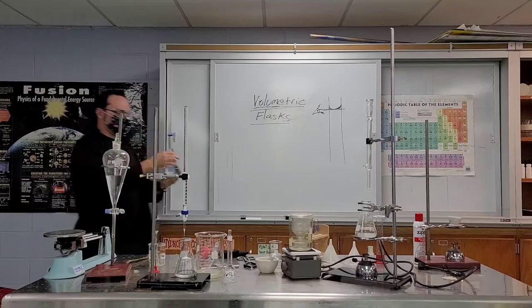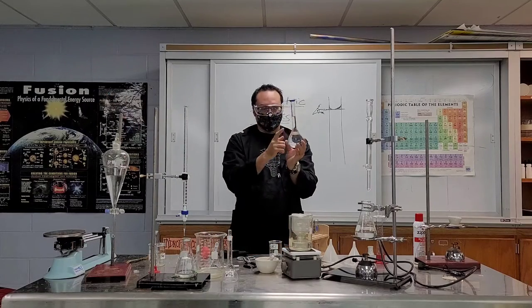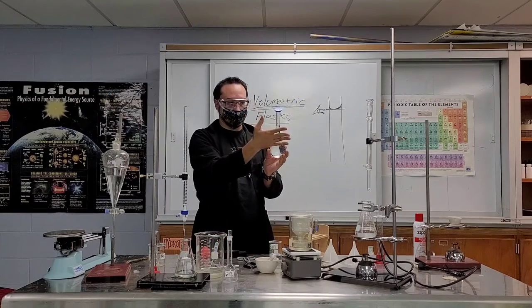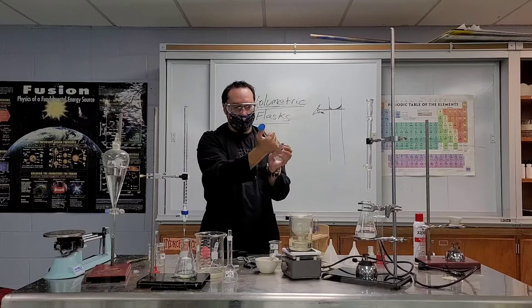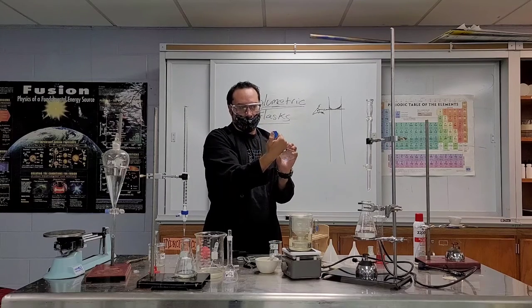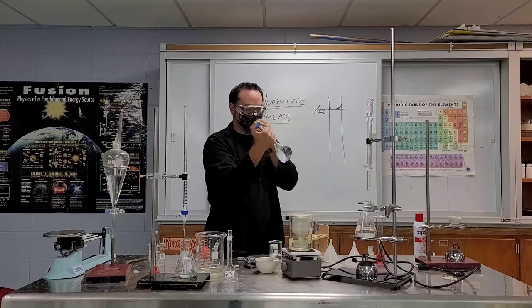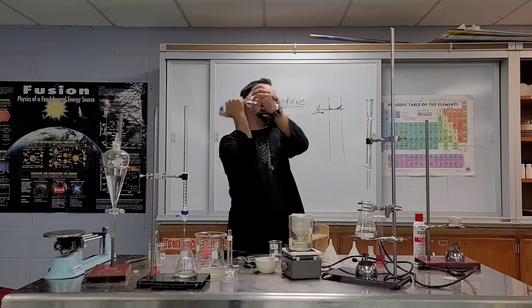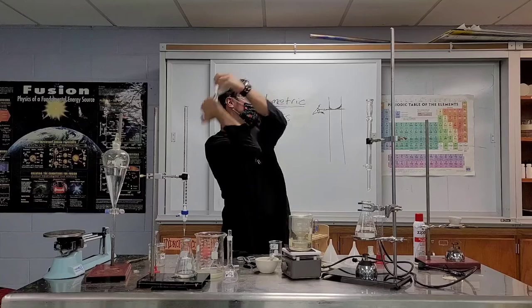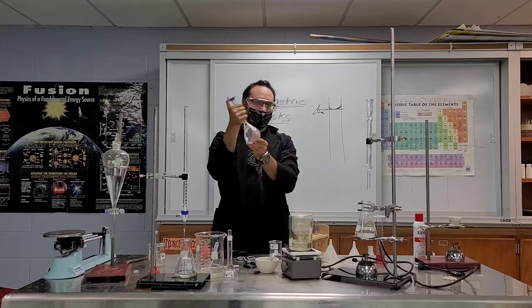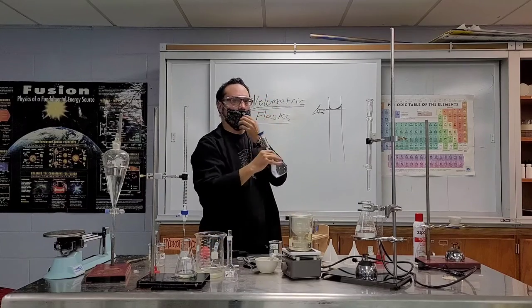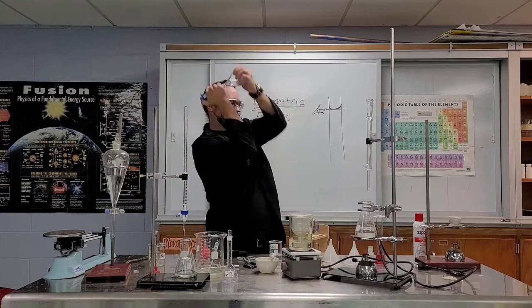Here's what you always do. A little bit of a safety thing here. To shake this, what you always do is grab the neck and the bottom, put your thumb over the cap, always point stuff not at your face. I usually point it like behind me and go like this. Don't go like this because this can explode off, you never know what's going to happen there.